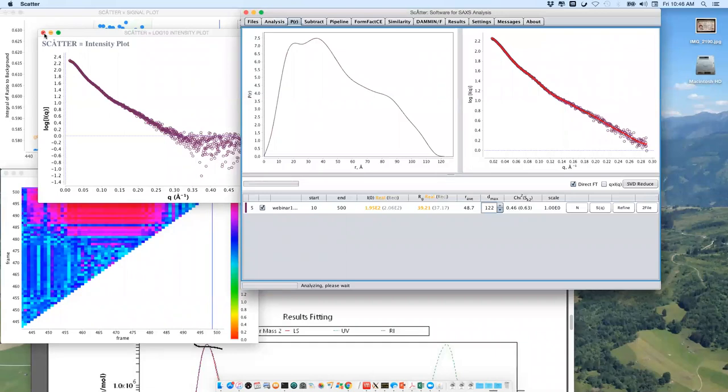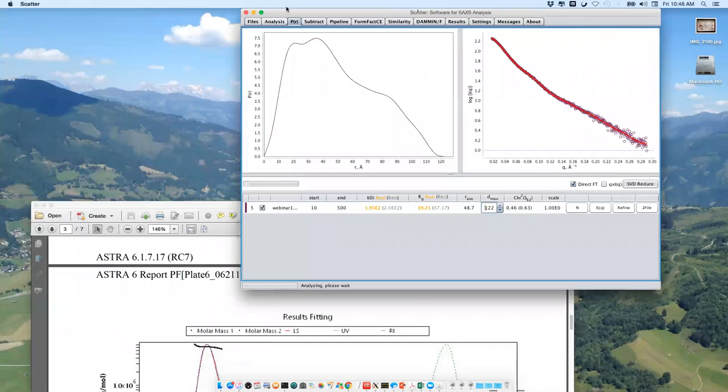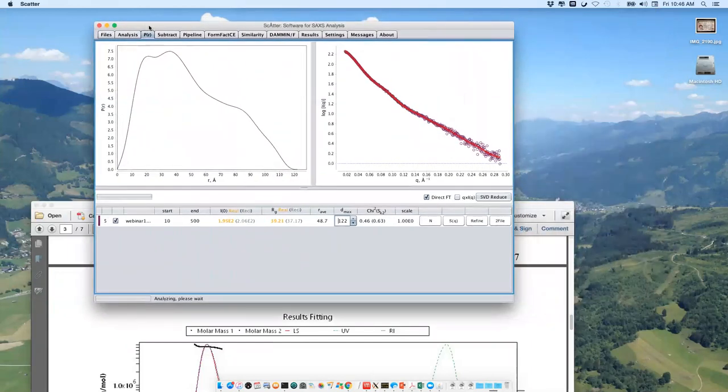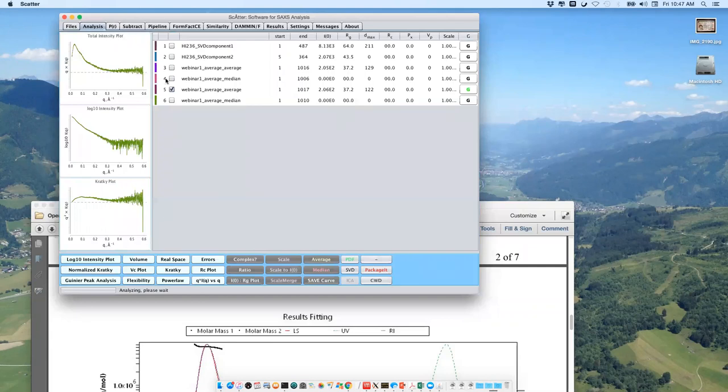Let's go to something more difficult. I've seen that there were a couple of questions after I sent the reports about why I have no scattering profiles. Most likely what happened was that the sample wasn't present. You guys definitely checked the concentrations, but we spin each sample before we put it on our size-exclusion SAXS system. So maybe they aggregated over time or precipitated, and through the spinning procedure, we basically lose most of the sample. That could happen, and I'm going to show you a case where it happened and how you can see it.